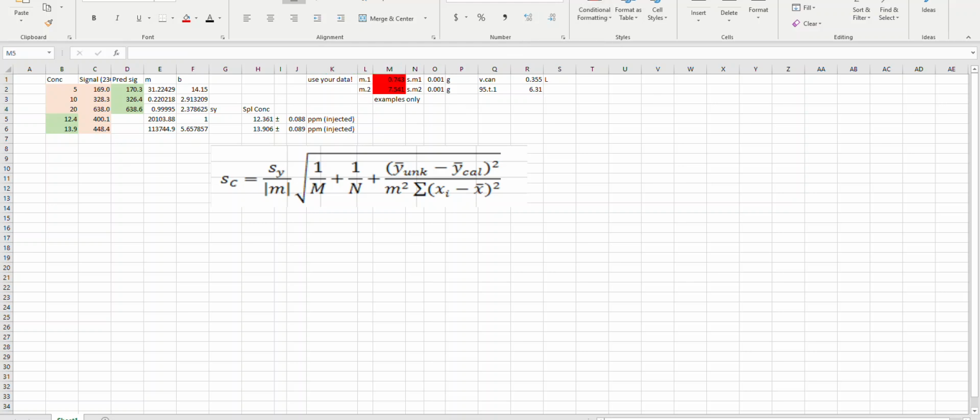We're going to take the sample concentrations and multiply them by the volume ratios there. So what we got here is equals this times this. Oops, wait, can't do that yet.